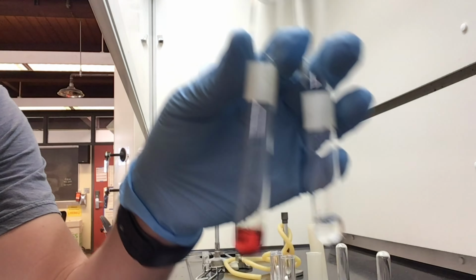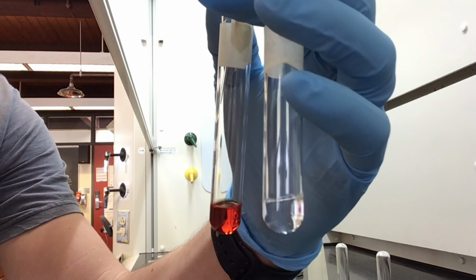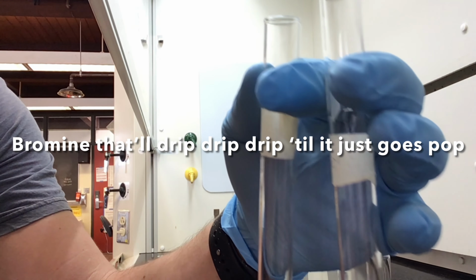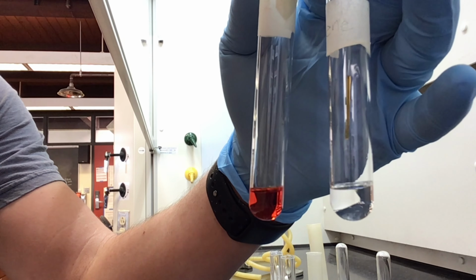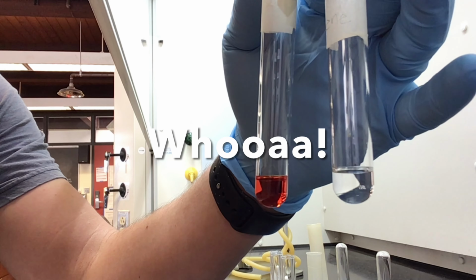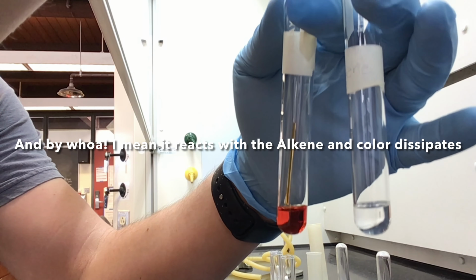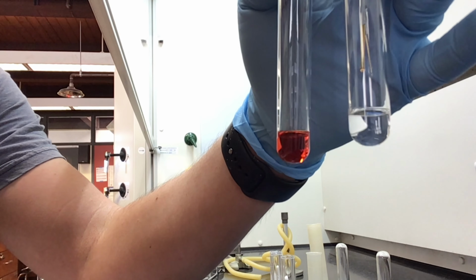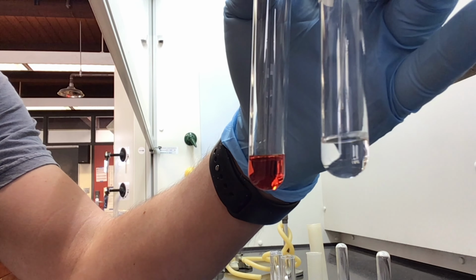Okay. What happens when I drip that bromine into my alkene? Okay, so we said an addition reaction. Bromine, that'll drip all day long. Whoa. All right, did you see anything? I didn't see anything. The alkene is reacting with it, so that beautiful red color is disappearing. It drops in and it's gone. It's like it never happened.